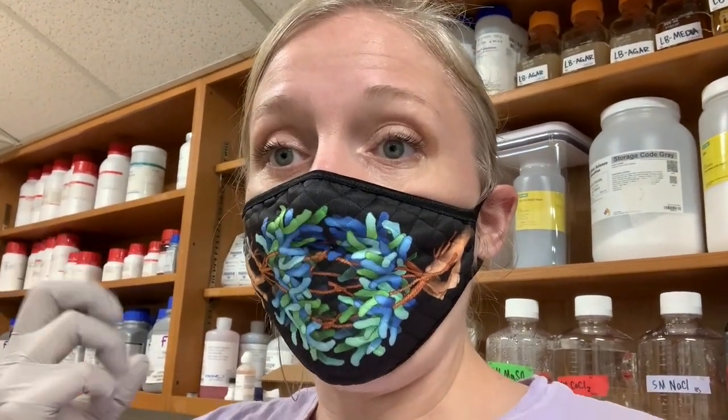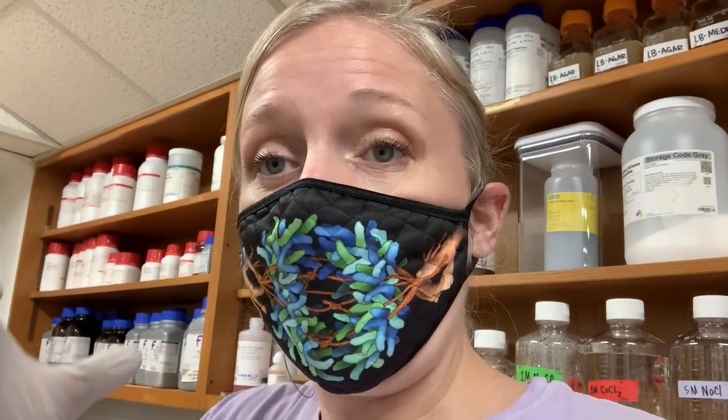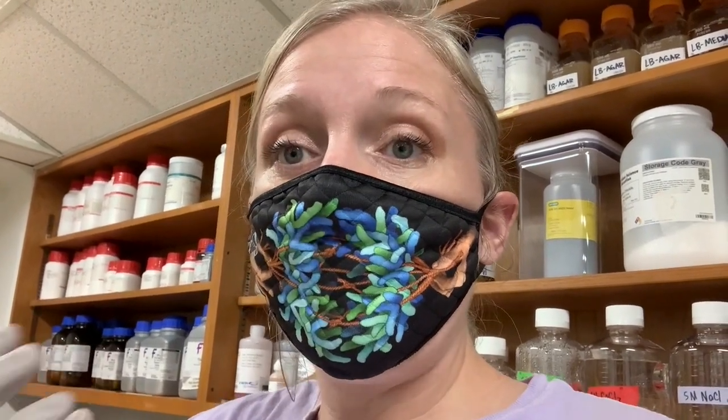And so I've already put my P1000 pipetter and my P1000 filter tips in the chemical hood, and I've also taken my bottles of 10x PBS and water, so just ultra pure water, to the chemical hood. And so what I will do is take you with me to go get the DEPC and take it to the hood so that we can add it to our solutions.